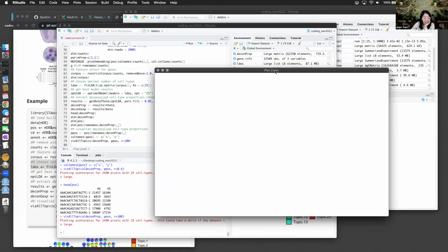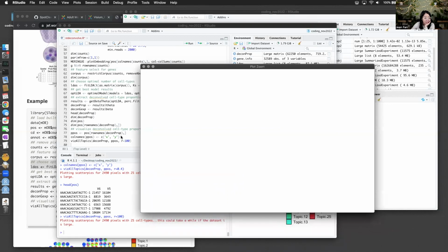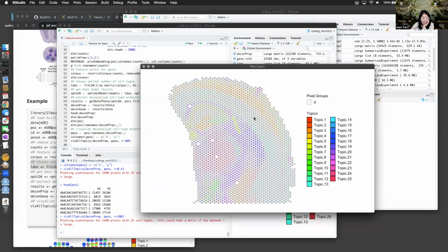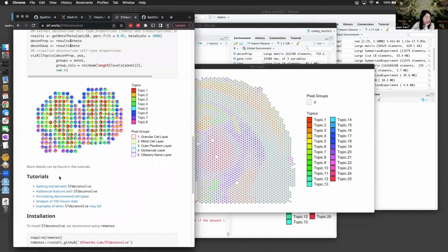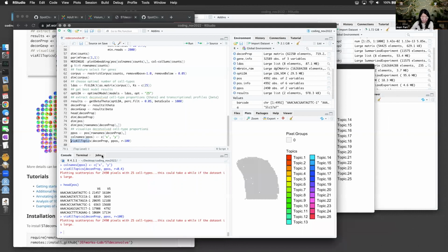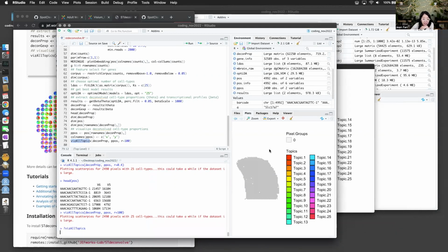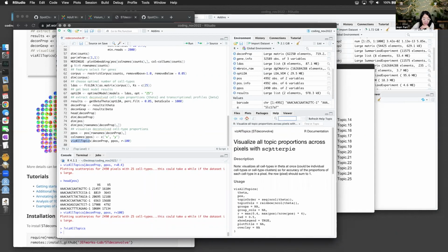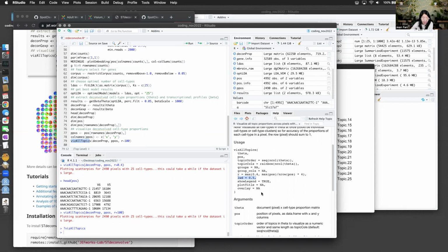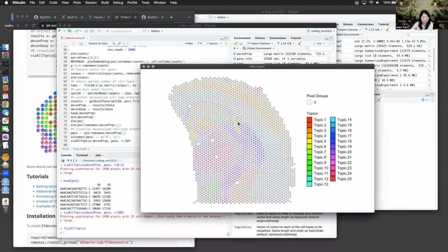Looks like our previous results came up. Okay, great. Actually looks pretty good. I don't like these lines though. So is there a way for us to get rid of these lines? Let's read the documentation. And okay, there's an LWD setting. But 100 looks reasonable.